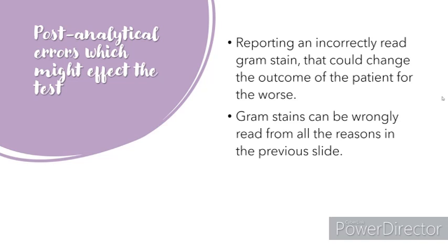Because your patient depends on it, really. Sometimes, most of the time, when they're ordering it stat or something like that. And the reason being, gram stains can be read wrong.